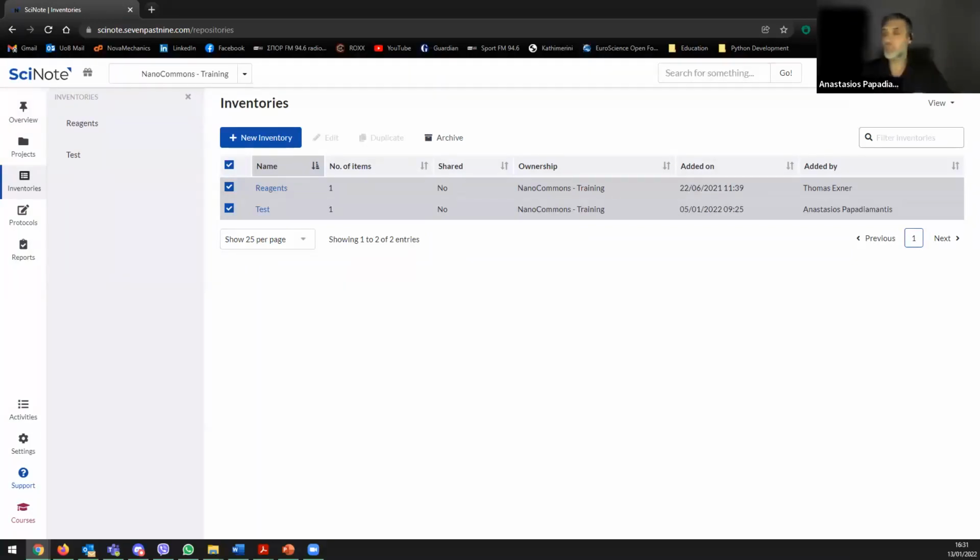But in this case, more or less, you already know the person, you already know his personal details, so that's not data sharing, personal data sharing.